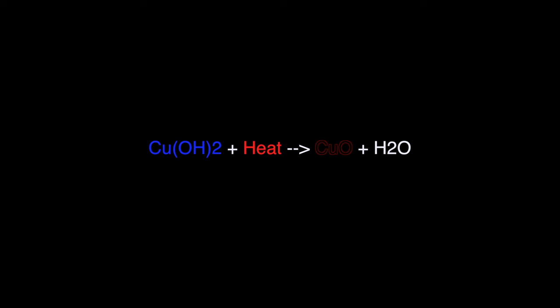Now the copper hydroxide is decomposed using a heat source. This will form dark black copper oxide and water.